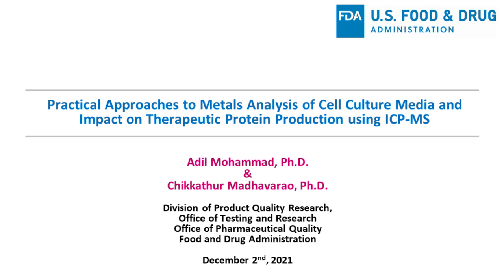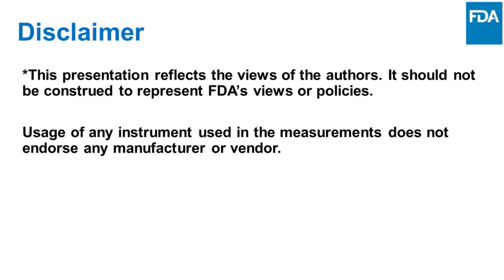So the topic of my talk is practical approaches to metal analysis of cell culture media and impact on therapeutic protein production using ICP-MS. This is just a disclaimer that whatever I'm presenting right now is just our research and views of our author, and it doesn't represent FDA views or policies.